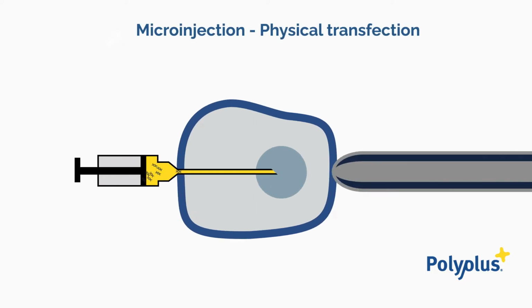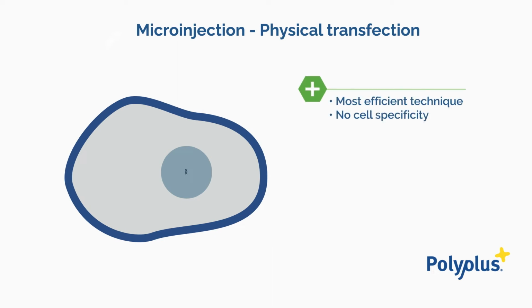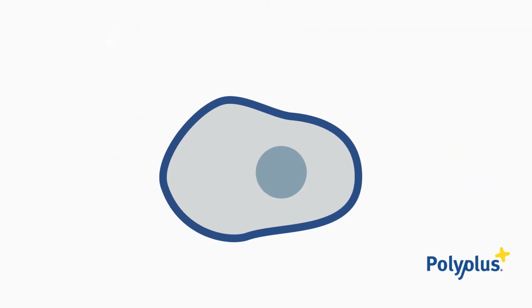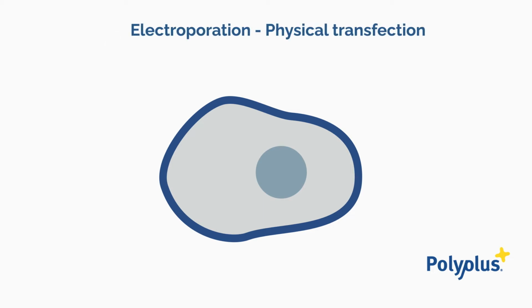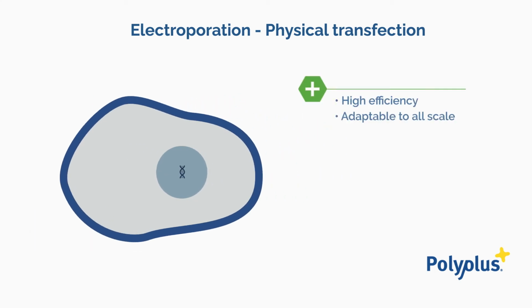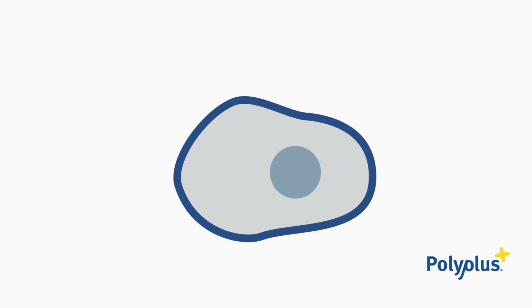Microinjection allows penetration of the cell membrane and nuclear envelope with a glass micropipette. This technique requires extreme precision and high levels of training. Electroporation corresponds to the use of high-voltage electric shocks to introduce nucleic acids into cells by creating pores. When these pores stay open, cell homeostasis is lost and cells die, which is the main drawback of this approach.